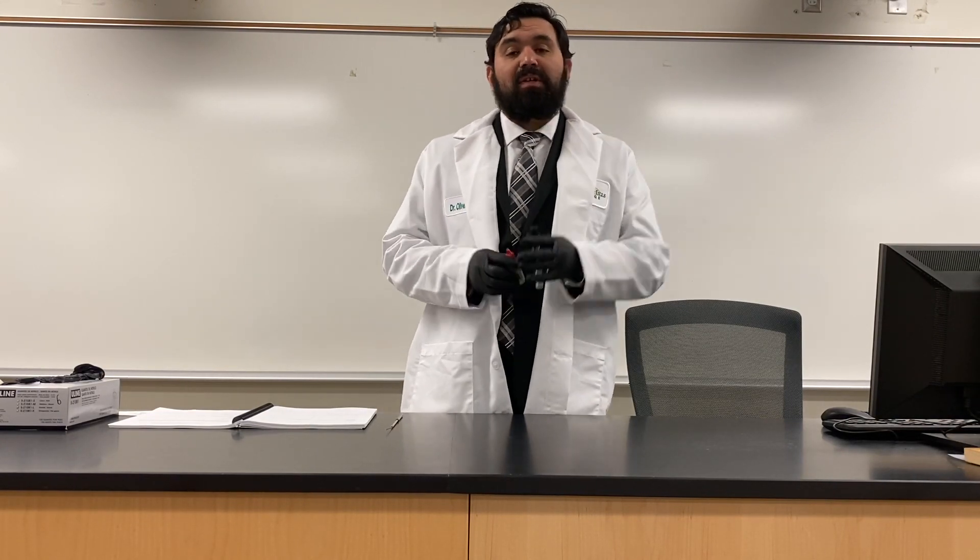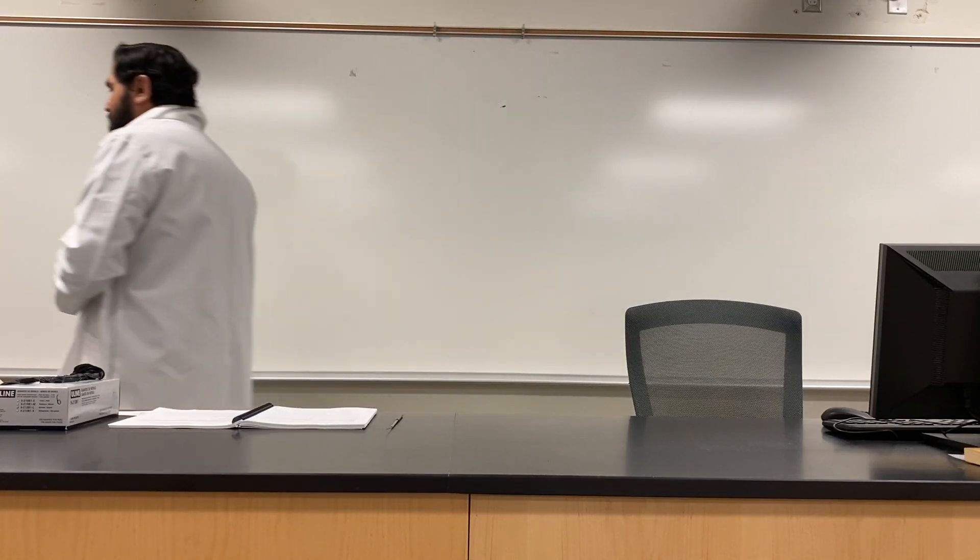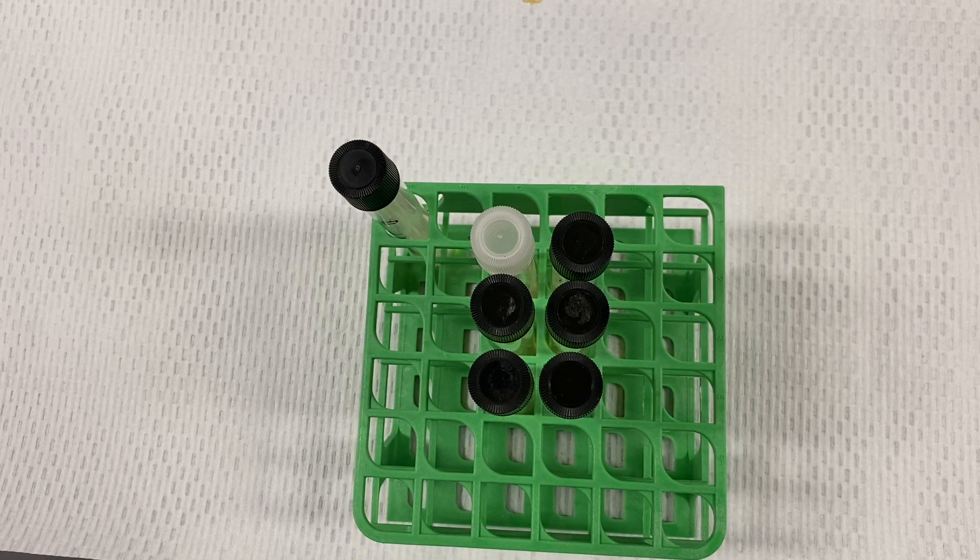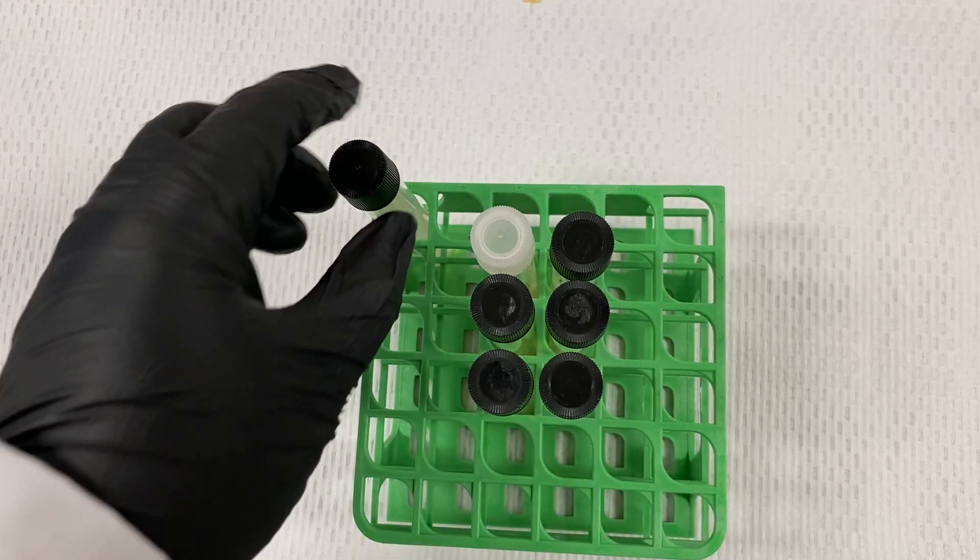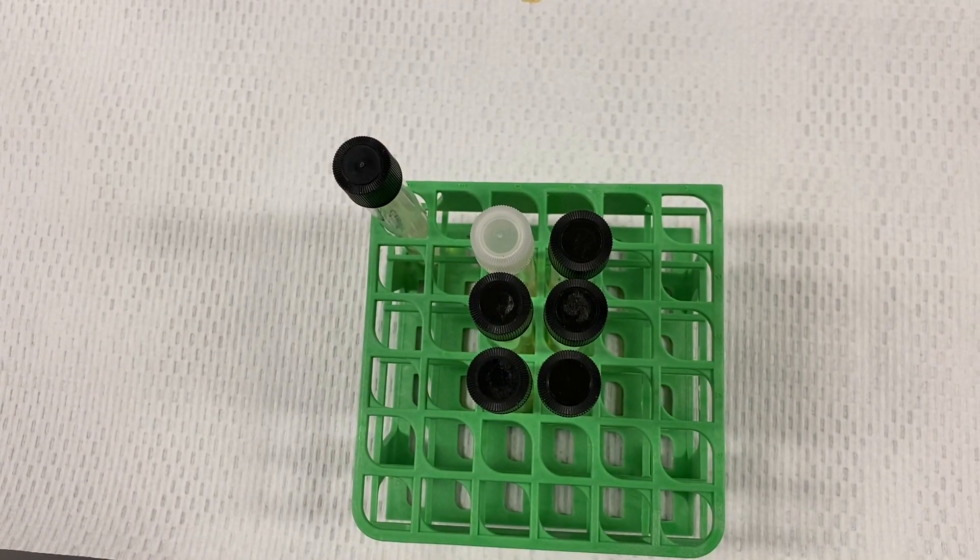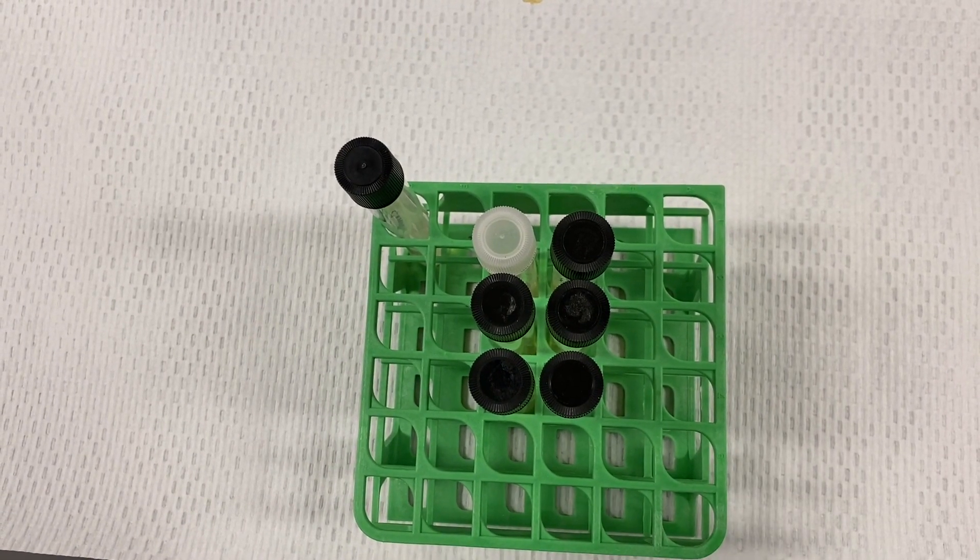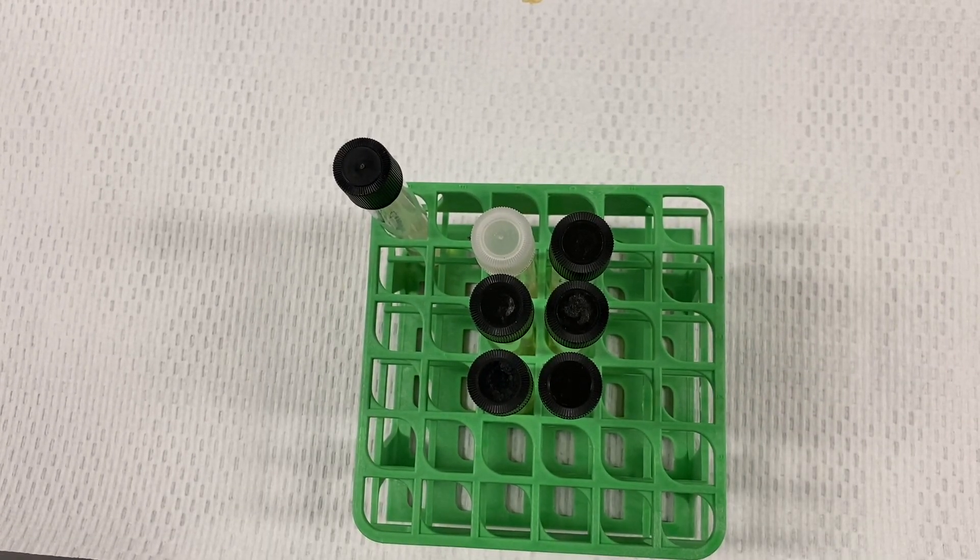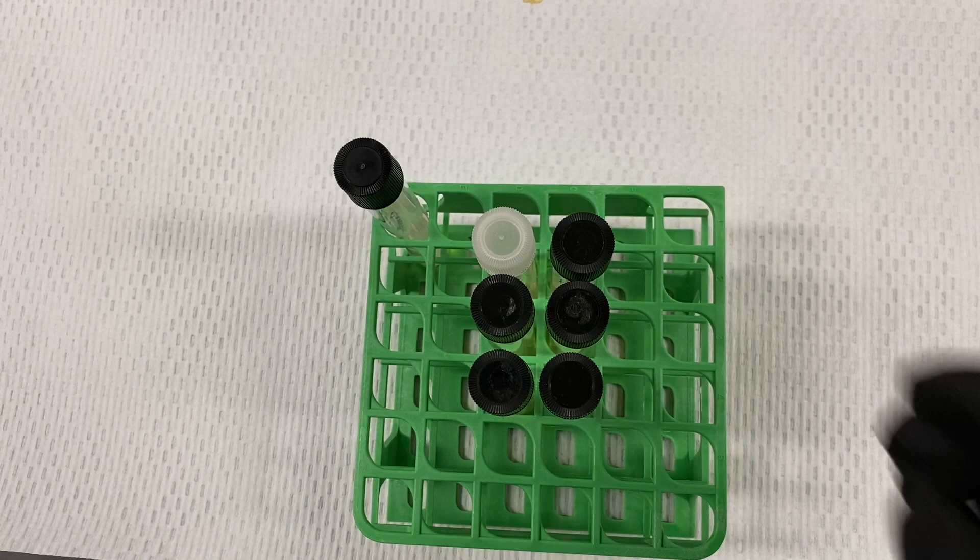Laboratory 27, the phenylalanine test, involves the deamination of phenylalanine by removing the amino terminus and converting it into phenylpyruvic acid. We test media enriched in phenylalanine inoculated with different organisms. After about 24 to 48 hours, we add a few drops of ferric chloride on the surface of the slant to see if it changes color. In this case, we're going to take one as an example that has already been inoculated.